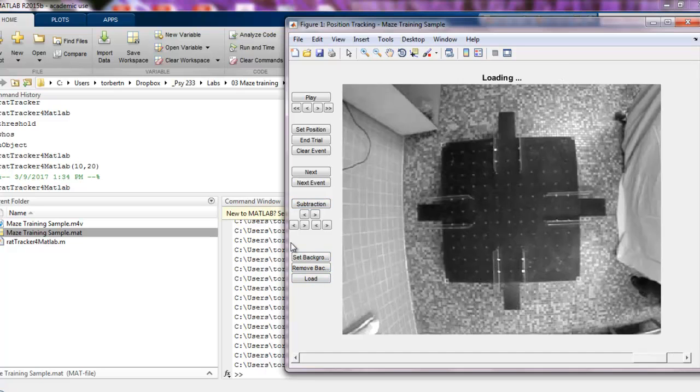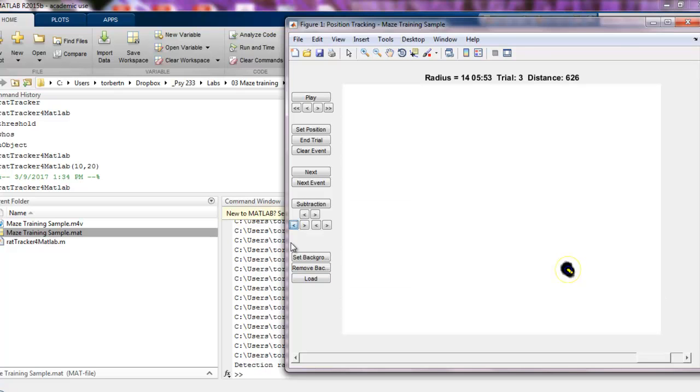The only other thing I'll mention is that in some videos I've used before, the perspective comes out incorrect, and it turns out that I need to use a non-circular radius. The buttons here let you adjust the radius of your tracking. I like 15 for the ones we've been doing.